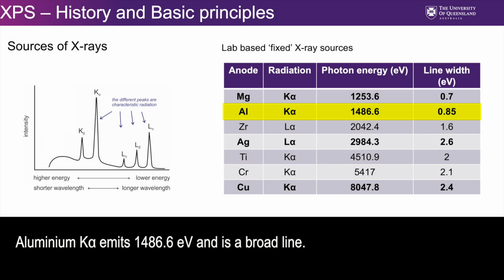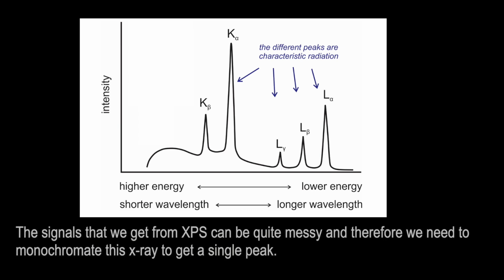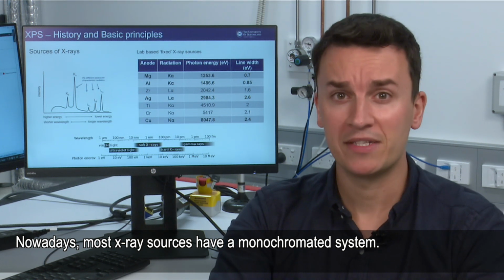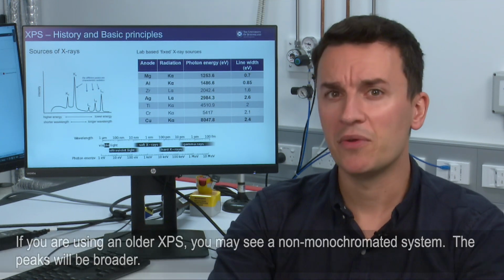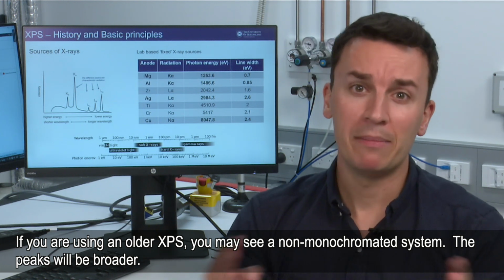Aluminium K-alpha emits at about 1486 eV, but it's quite a broad line. We also get a secondary signal from the K beta peak, which is next to it. And so the signals that we get from XPS can be quite messy, and therefore we need to monochromate this X-ray to get a single peak. So nowadays, most X-ray sources have a monochromated system, but in the olden days, if you're using an old one, we might see a non-monochromated system, and the peaks will be a bit broader, and there'll be satellite features here.